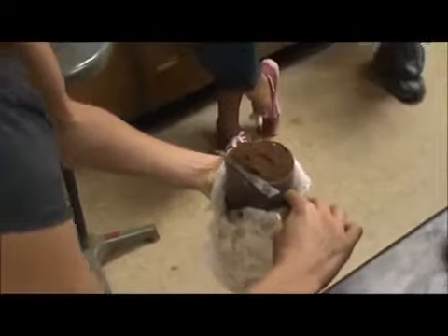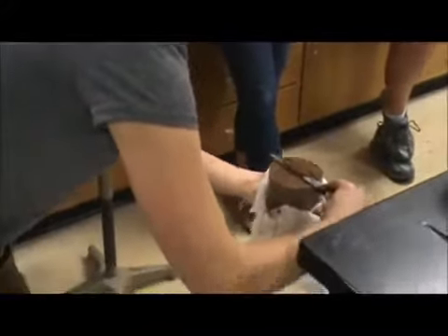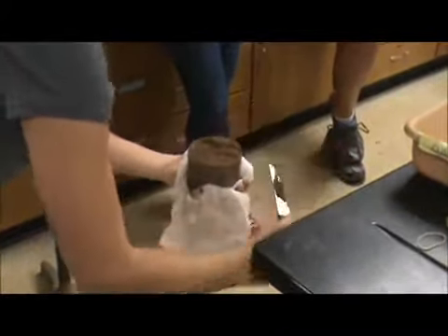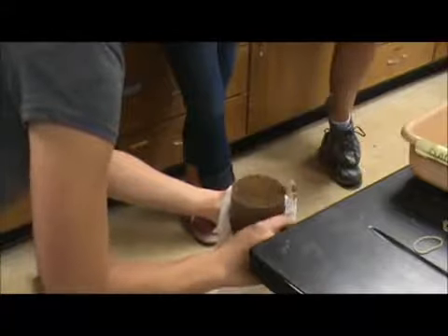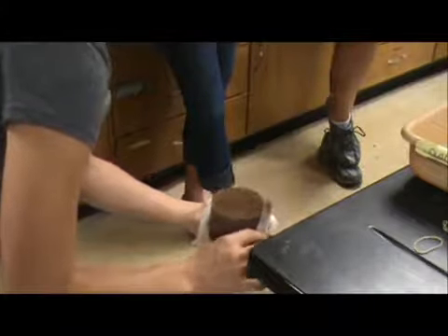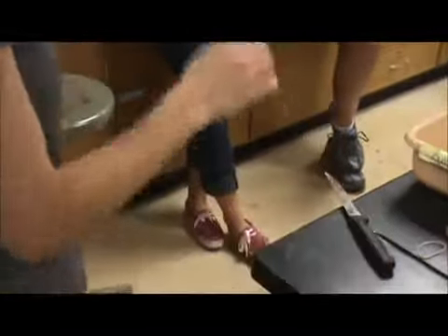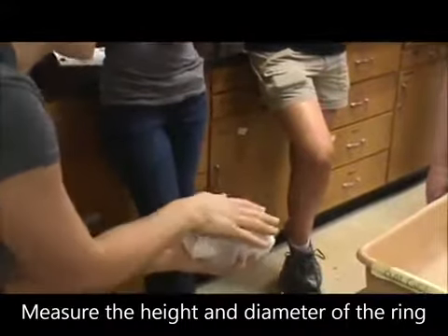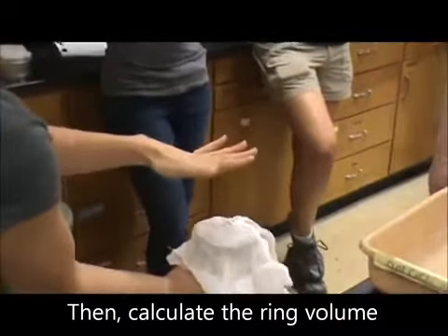You want to get it perfectly flat all the way across. Watch out for bigger pieces that could flick out accidentally — that's why you do it slow, because sometimes you've got little rocks. Once this is perfectly level, the soil volume is going to equal the volume of the ring. Then you're going to wrap the cheesecloth back, put your hand here so nothing falls out, flip it over, and do the same thing to the other side.